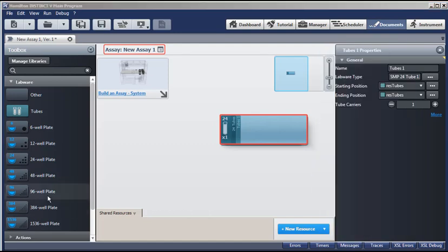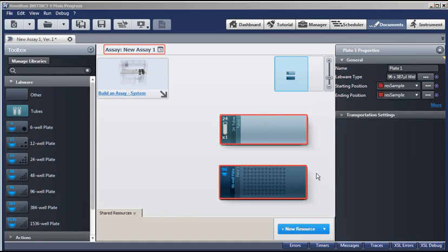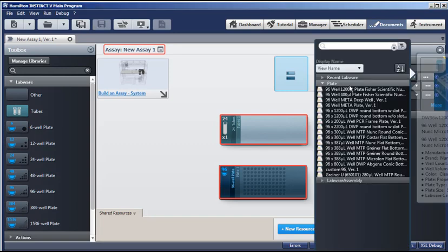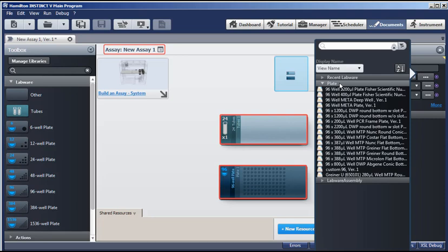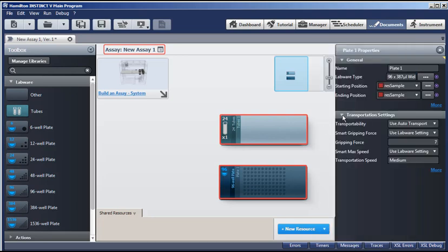For our target, we select a 96-well plate. Then double-click and set the properties. Select the starting and ending position for our resource from the drop-down list. And also the labware type from this list of plates. And the transportation settings have default values that we can use for our assay.